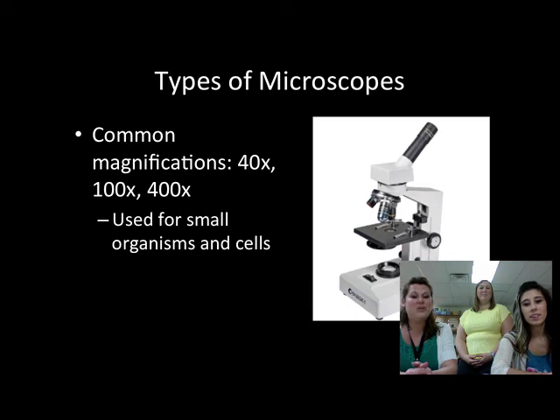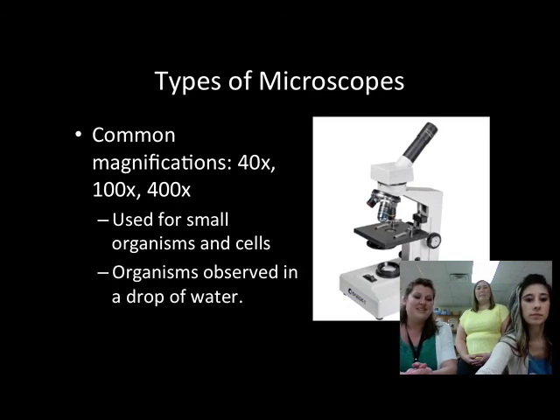These are used for small organisms and cells, a lot of the slides that we'll give you to observe in class, and organisms observed in a drop of water.